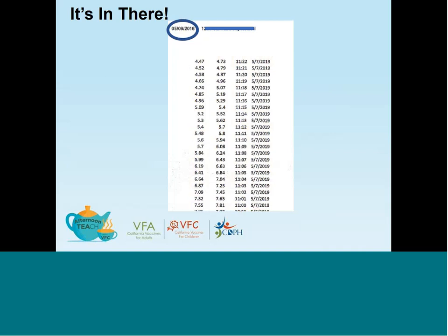So here's one more report we want you to take a look at to give you an idea of how to review or analyze the data. If you notice in the top left corner, the date there says May 9th, 2016. Of course, a red flag is already up for me because we're in 2018. When I take a closer look at all of the temperature data that was collected, I can see that the day this data was collected says May 7th, 2019.